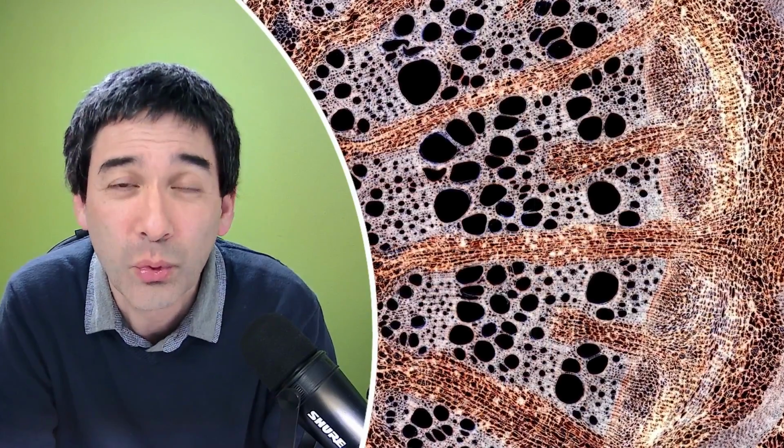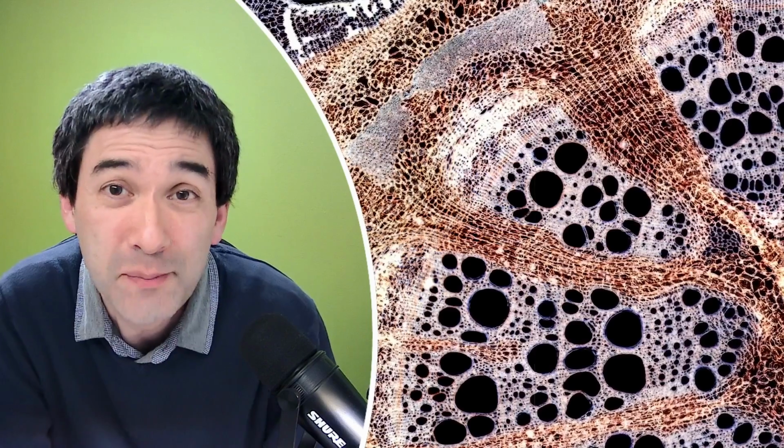But it's not possible for me to really identify a microorganism all the way down to the species level in most cases just by looking at it. It's not going to work. So I can tell you also that in many cases, I don't know what the organisms are, also because maybe some of them are not even in the identification book that I have. And maybe some of them indeed are in the identification book, but they look kind of similar or maybe identical, but maybe they're different species still.